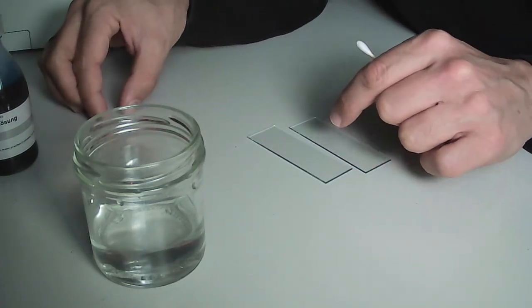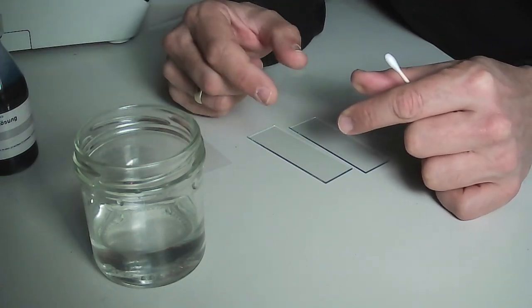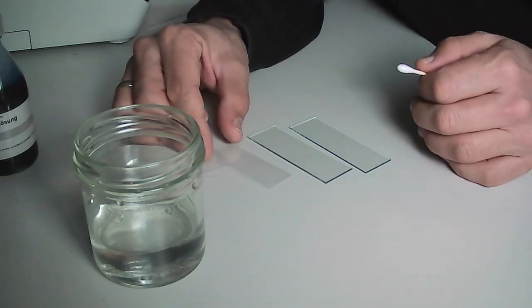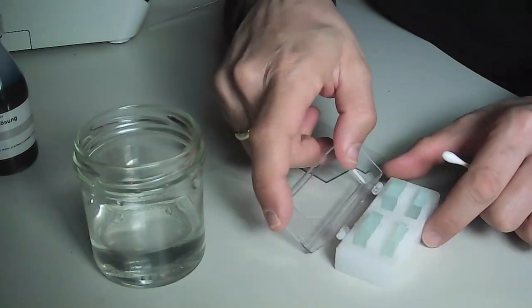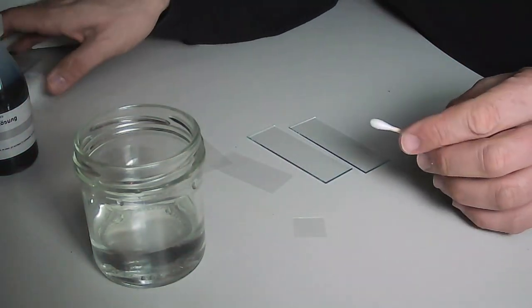And what I'll be using is those larger cover glasses. They're actually quite a bit larger. You don't have to use those, but I consider it kind of convenient because you simply have more area. Of course, the normal cover glass size is much smaller. Whatever you have is fine, okay? That's not so much the point.